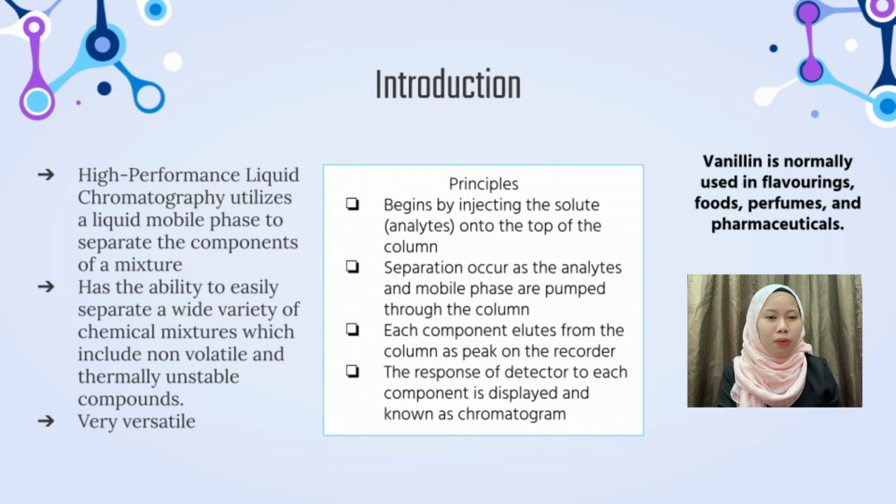HPLC, or high-performance liquid chromatography, utilizes a liquid mobile phase to separate the components of a mixture. High-performance liquid chromatography is very versatile because of its ability to easily separate a wide variety of chemical mixtures, which include non-volatile and thermally unstable compounds like organic, inorganic, and biological samples.